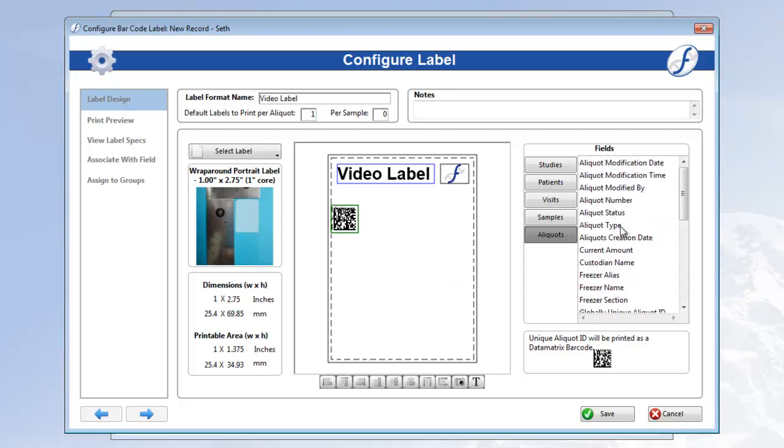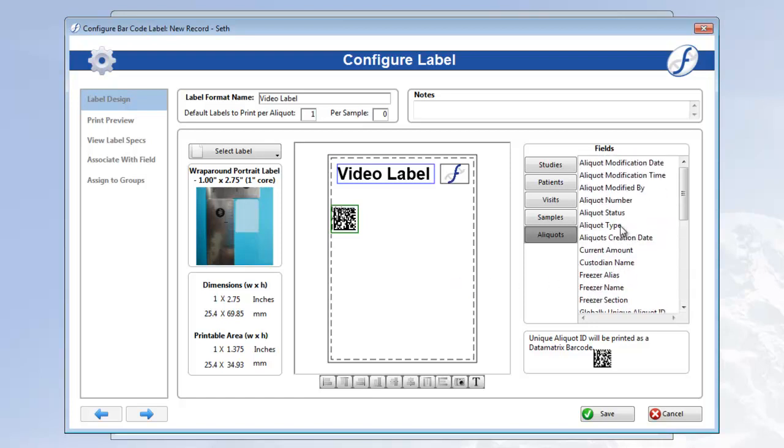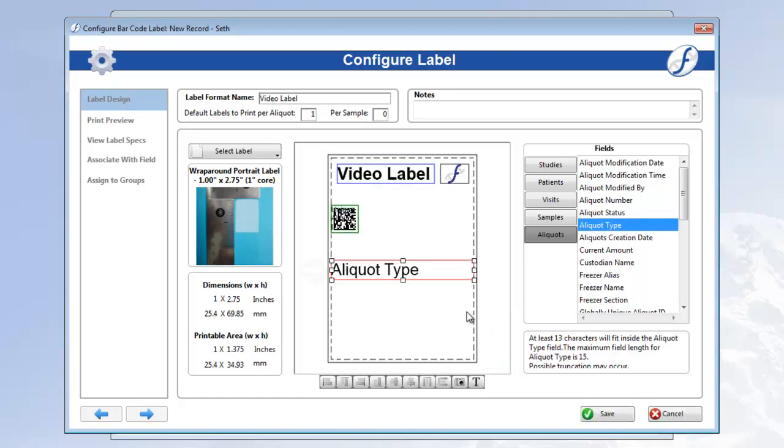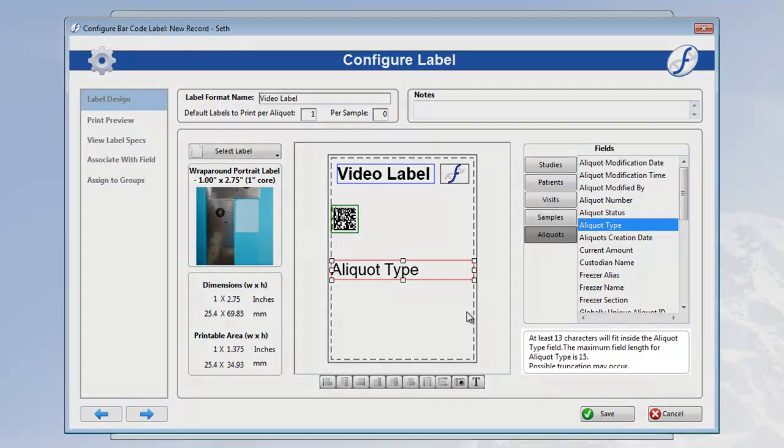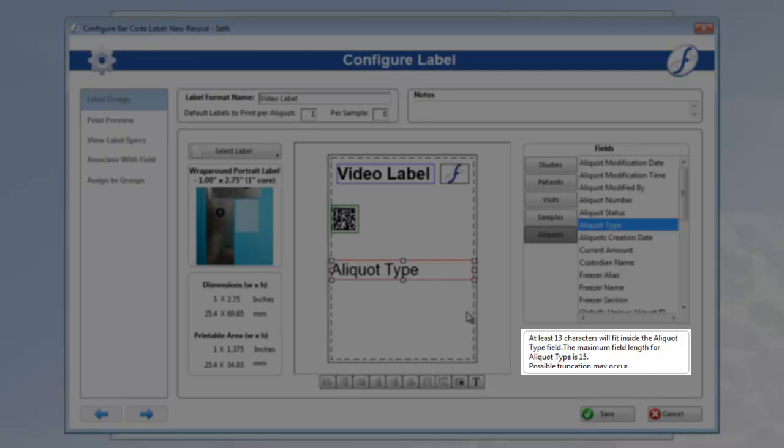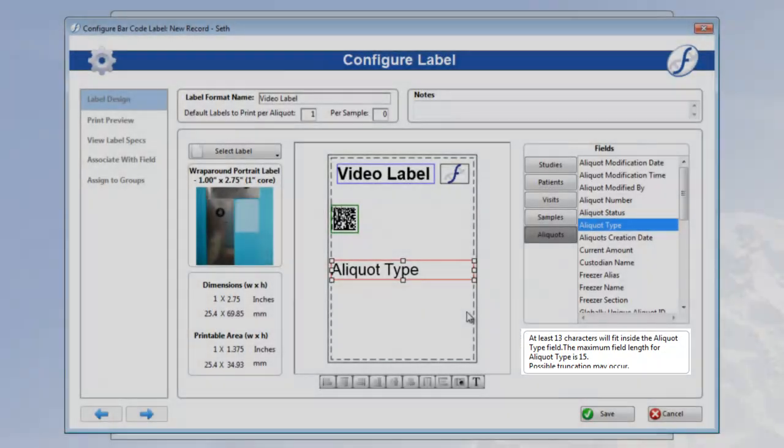I'll demonstrate this by placing aliquot type on my label. As you can see, we have a red border around the aliquot type field object, and the info in the bottom right box tells us exactly why. The maximum field length for aliquot type is 15 characters, and this object can only fit 13 at its current size.